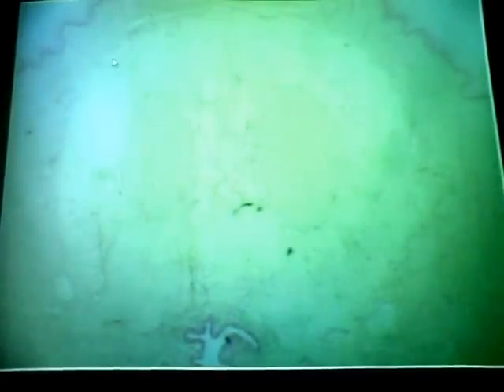Here again is urethra. This tissue around here again is the corpus spongiosum. And the two paired dorsal columns, dorsal to the urethra, corpora cavernosa. There's also connective tissue around here which doesn't show too well, it supports. Okay. So on the outside again, covering the penis, non-keratinized stratified squamous, lining the urethra, transitional epithelium, then the 3 columns of erectile tissue: that around the urethra, corpus spongiosum, the 2 columns of erectile tissue dorsal to that, which eventually get much larger, the corpora cavernosa. Any questions?